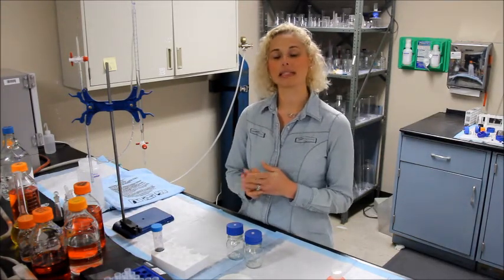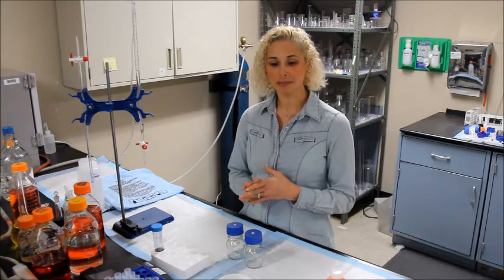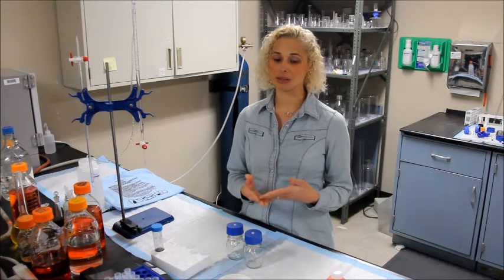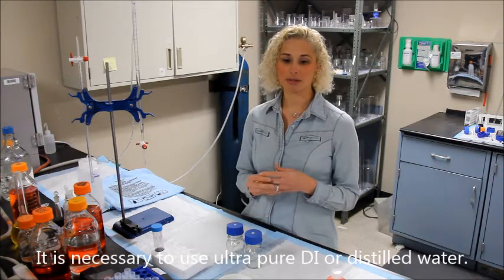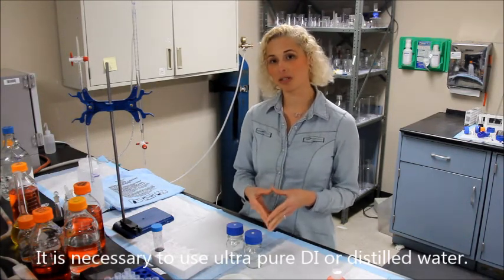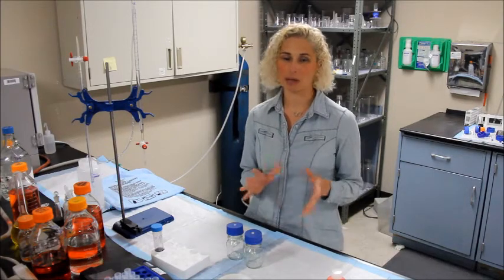I am also going to be using deionized water throughout the procedure. Distilled water is also okay, but it is necessary to use ultra-pure water — make sure you use recently purchased or brand new deionized water.